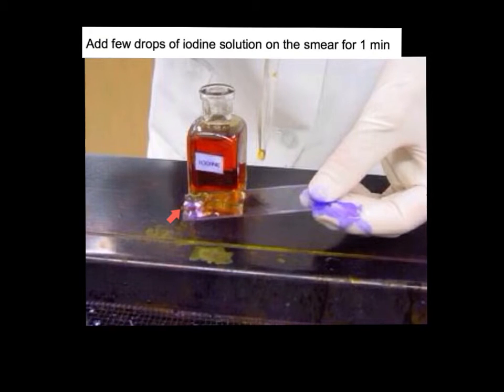Okay, our second stain that we add is iodine, and again I know our directions say add a few drops, but I like to saturate our slide with our iodine, and this right here will act as our mordant, which will cause our crystal violet complex to latch onto the peptidoglycan layer. So we will let this sit roughly a minute.